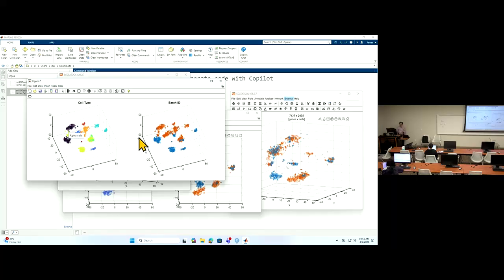So you have two separated clusters. They are the same cell type but at a different development stage, 8 weeks and 14 weeks. But harmony will merge them according to the results here. So this merging to me makes sense because they are the same cell type at the end.